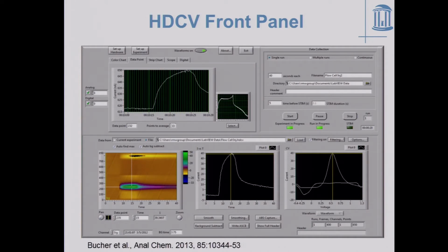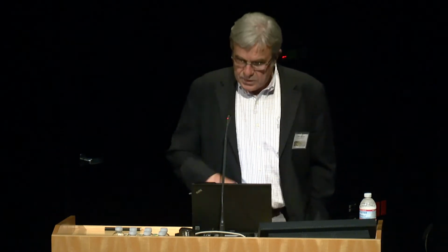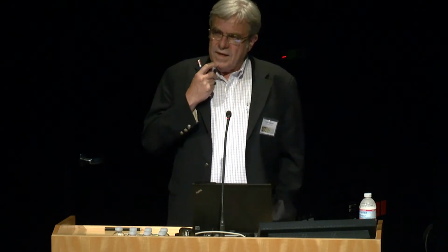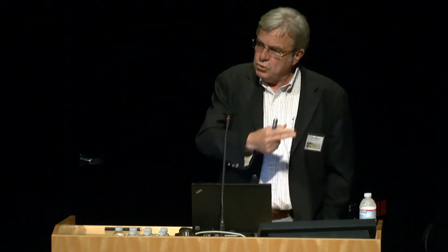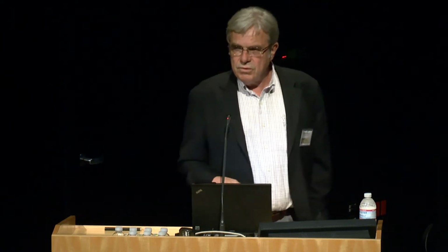Okay, so in the last year, we developed a program to put all this stuff into one package. It's available for free at our website. And so while you're an investigator doing the experiment, you can look at these things like how the current's changing at a particular potential, how the color plot is changing, what the cyclic voltammetry is doing. You control the stimulus frequency and all that kind of stuff. One of the really nice things about this program, and the reason I'm telling you about it, is the way I just talked you through the analysis of the data and how we could identify dopamine, sort of a crude approach.